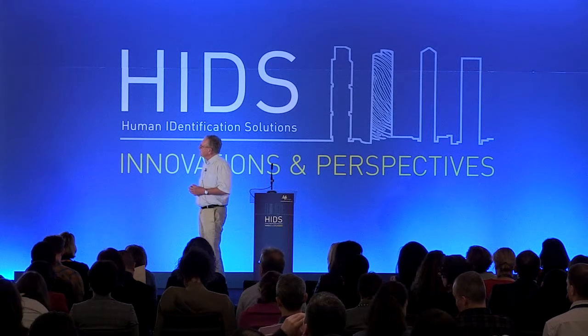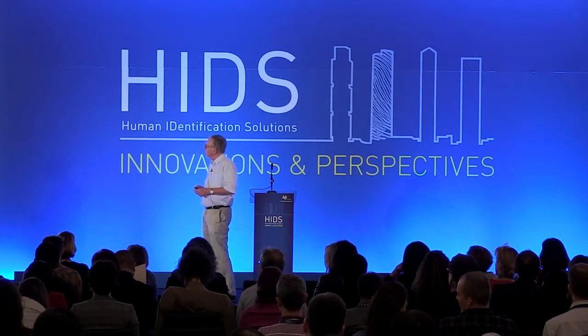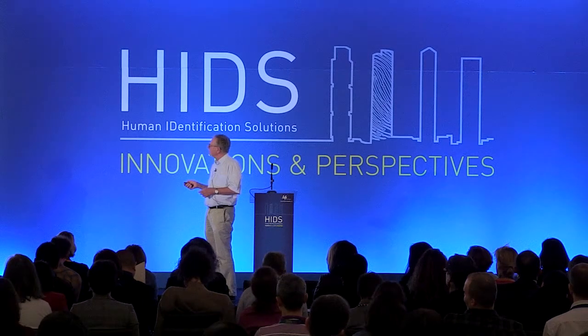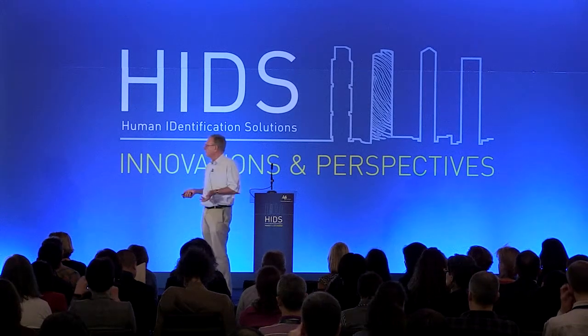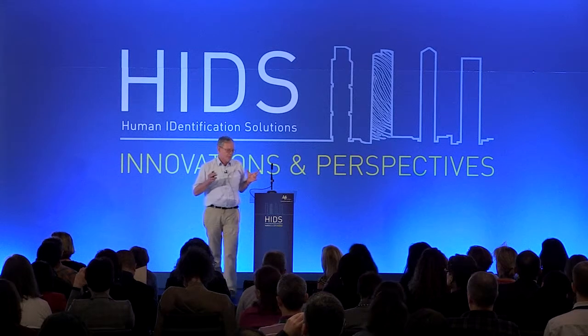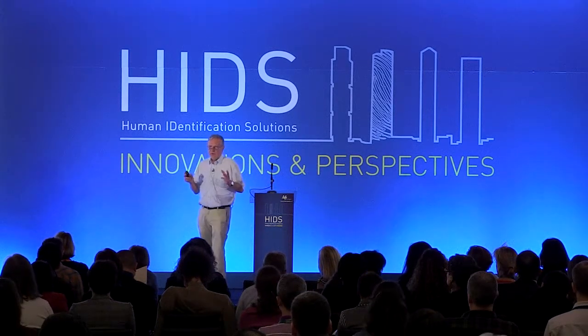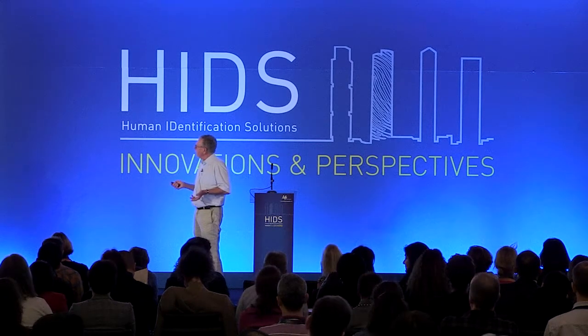In Copenhagen, we have these 3 small desk devices. The first one was this 454 technology, and we still use it, although it's slow and it's expensive, because it has the capability to sequence long stretches of STRs, and that's necessary in some contexts.